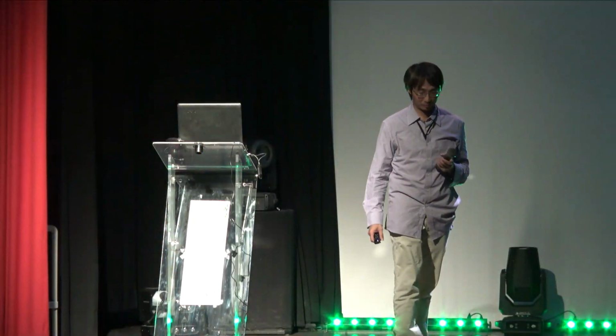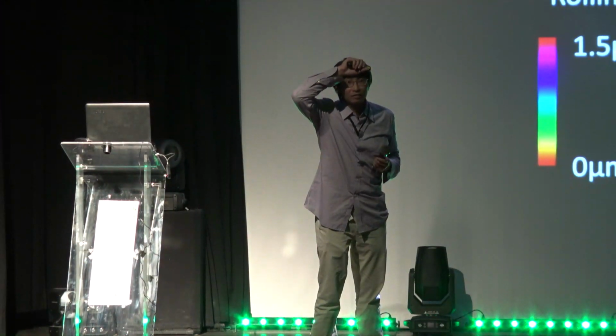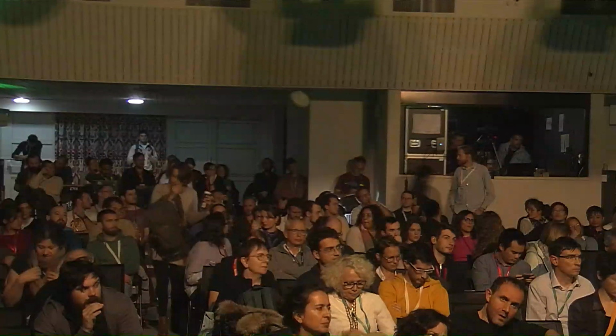Thanks for the great talk. Maybe a bit technical, but you have your secondary objective and your tertiary objectives tilted. How do you decide at what angle you position them?